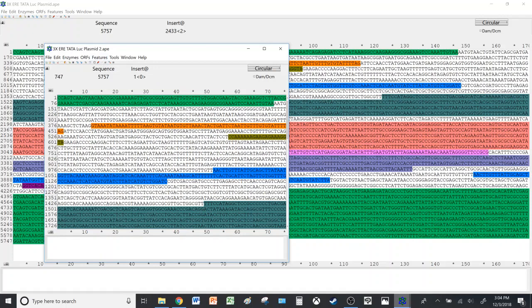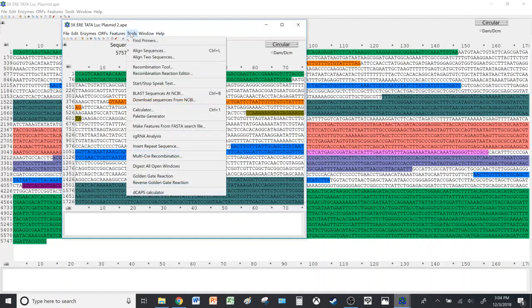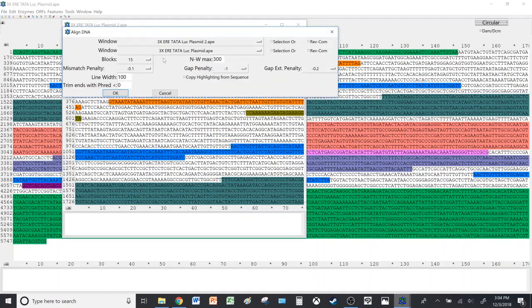So in the window of the second plasmid or the second sequence, while both windows are open, you click Tools, then Align Two Sequences. Then make sure that in one window is one sequence and the other window is the other sequence, and then hit OK.